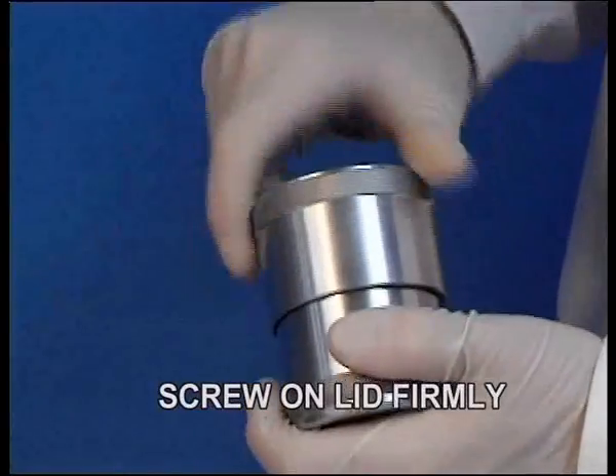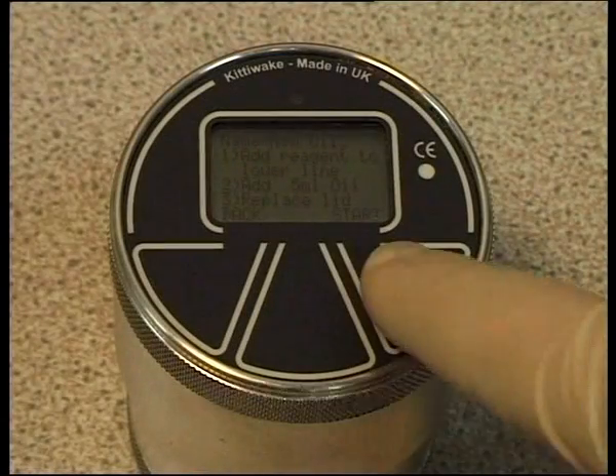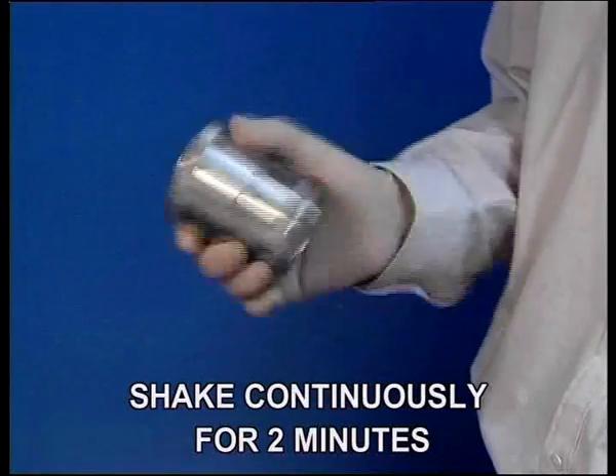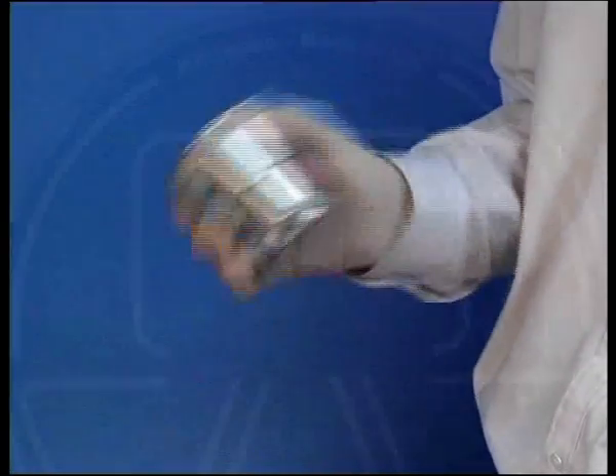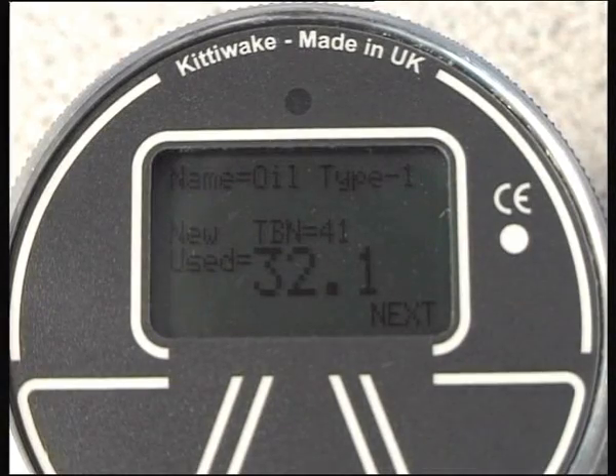Firmly replace the cell lid. Press the Start button. Shake the cell for two minutes, during which time a graph will be plotted and your results displayed on completion.